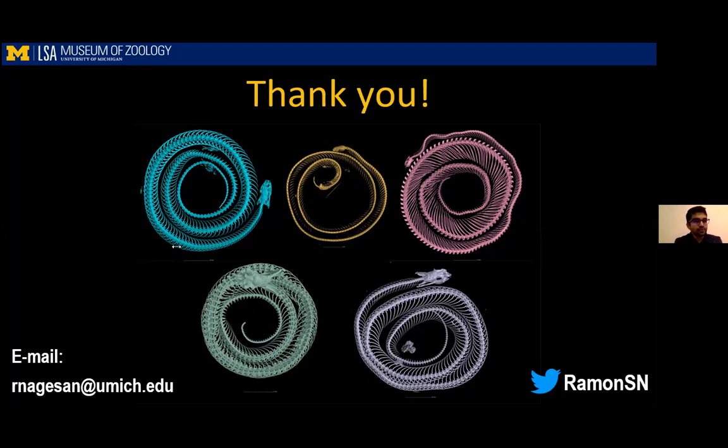So this is actually a good question. What is the downside to leaving a specimen stained with iodine? That's actually a really, really interesting question, because DiceCT is a relatively newer technique. I would say people have only really been doing it for about 10 years now, and it's only really been perfected en masse in the last 5-6 years.